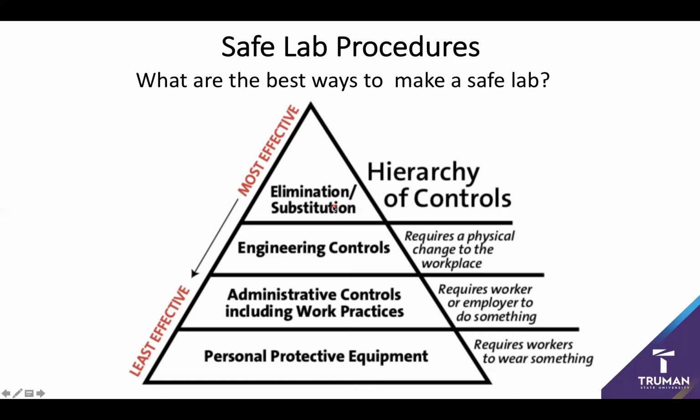And then finally, we have the one that most people emphasize the most, but it's kind of the last line of defense, and that's personal protective equipment, or PPE. So this is your lab coat and safety glasses. And these do tend to be fairly effective, but they only work when something has already gone wrong. So usually we need to have a failure at these first 3 levels before PPE ends up even coming into play. And PPE doesn't prevent something bad from happening. It just makes it less dire when it happens. Now, that in and of itself can be fairly important, and so we will also be talking more about PPE as we go forward. So, hopefully this gives you an idea of where we're moving on. Next up, we're going to be talking about some engineering controls based on what we now know for labeling and chemical reactivity. Next up is chemical storage. Till then, take care.